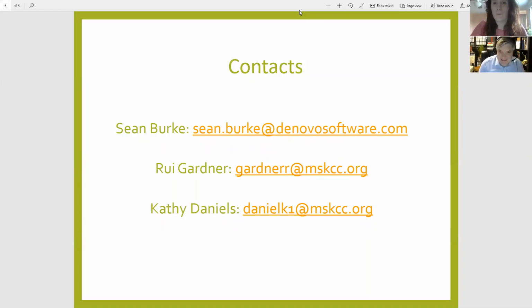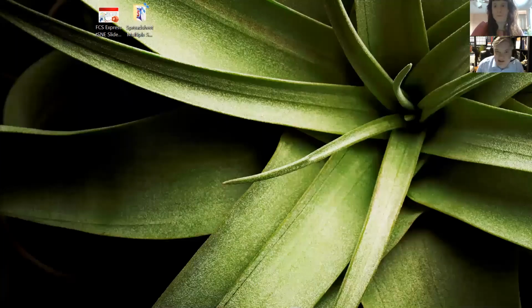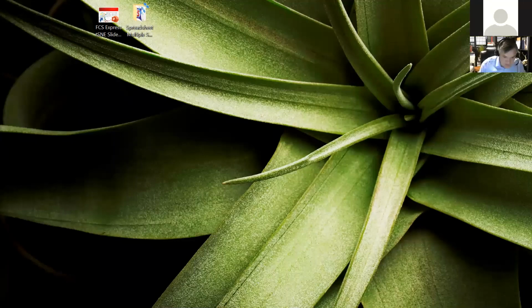Yeah, thanks, Kathy, and thanks for having me in here again today. It's good to see a lot of familiar names in the attendee or participant list there. Do you see the screen coming through over here? Yep, we're good. All right, great.